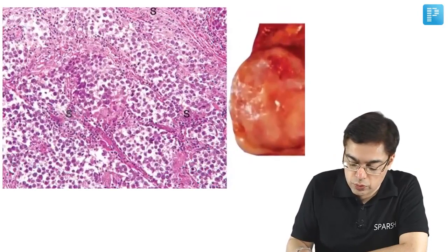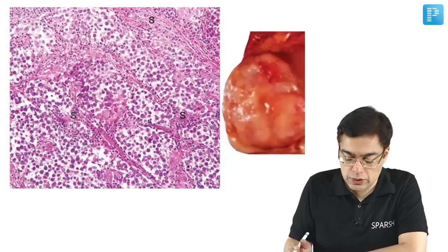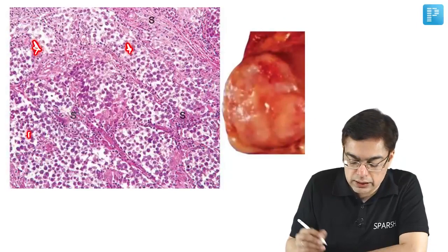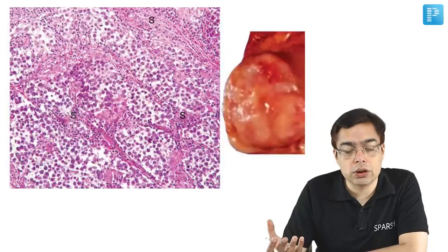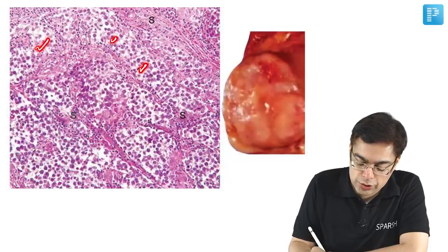Histological finding in association with the seminoma is very commonly asked in the exam. That's a very important question, very important slide. You would be having the presence of clear looking polyhedral cells, and the reason why the cells are going to be clear looking polyhedral is because these cells are going to be containing glycogen, which gets easily washed off. So that clear looking cytoplasm is what is going to be appreciated.